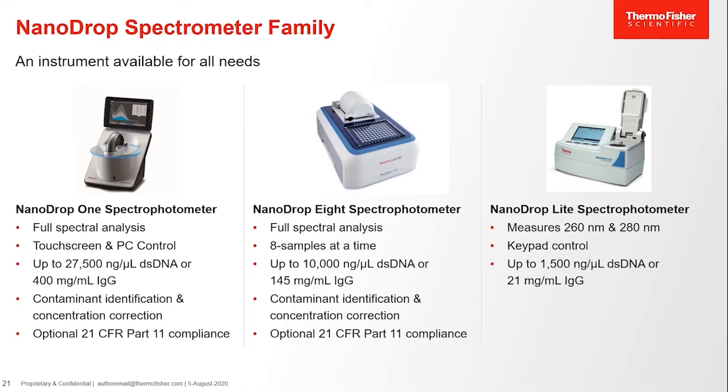The NanoDrop Lite is a basic instrument. It measures only 2 wavelengths, 260 and 280 nanometers, uses a keypad control, and it does have a more limited detection range of up to 1,500 nanograms per microliter of double-stranded DNA. And this can be used as a backup instrument, or other labs like to have multiple NanoDrop instruments, and this is an alternative or a secondary instrument that you might need.